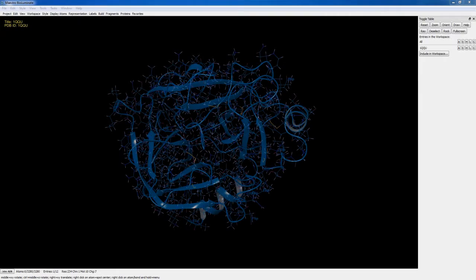In this video exercise, we will demonstrate how to run a protein-protein docking calculation where one protein is treated as the receptor and the other as the ligand. In the general case, it doesn't matter which protein is treated as the receptor and which as the ligand, but for antibody-antigen docking, the antibody is the receptor and the antigen is the ligand. The docking is performed as a rigid body optimization, and there is no subsequent minimization of the interfacial region. With that in mind, let's begin.